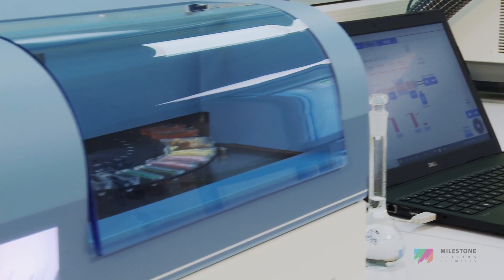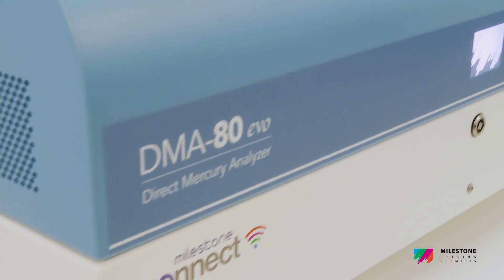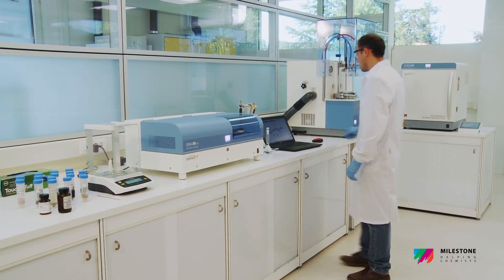Milestone has been at the forefront of direct mercury analysis for almost two decades, with thousands of units installed worldwide.